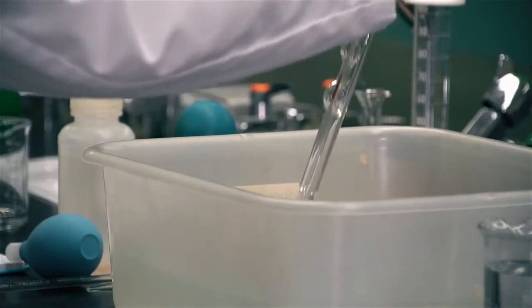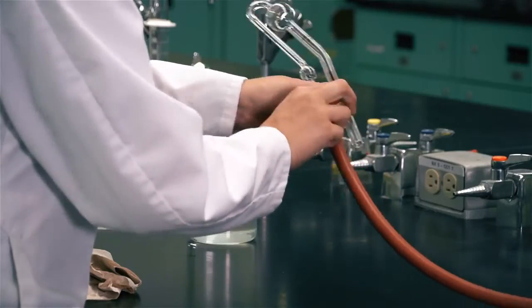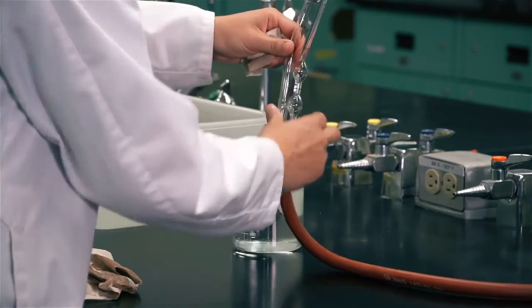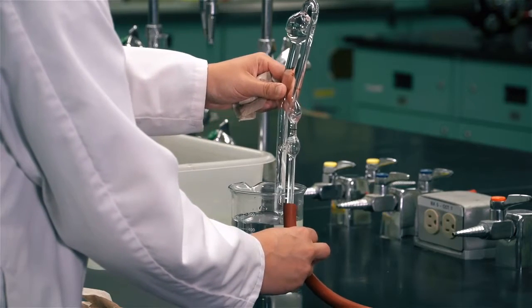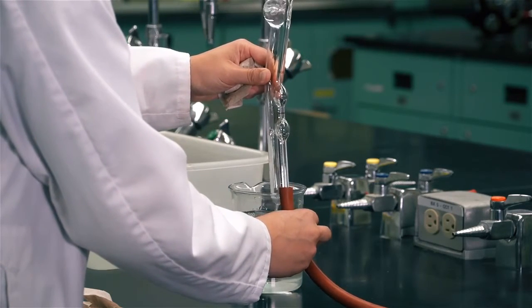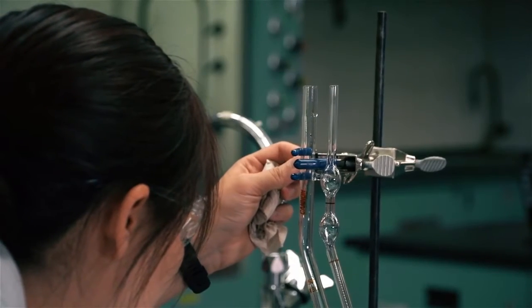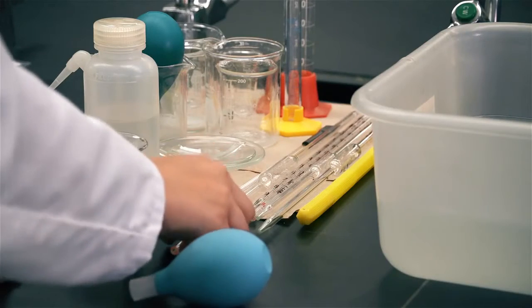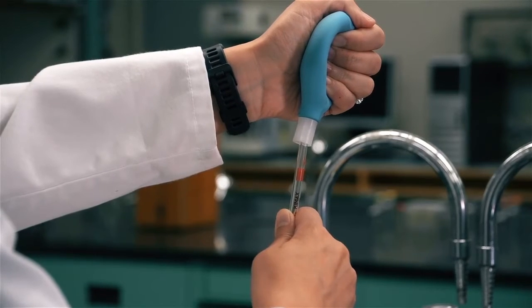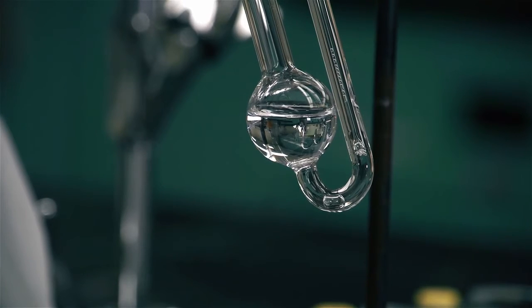Remove the viscometer from the detergent bath and rinse it thoroughly with water using a large beaker and a water aspirator. Rinse the viscometer with the solution whose flow time is to be determined. Carefully clamp the viscometer on the wide leg just above the bridge in a vertical position. Using a volumetric pipette, introduce 10 mL of sample into the large bulb of the viscometer. Allow about 3 minutes for the viscometer and sample to reach thermal equilibrium.